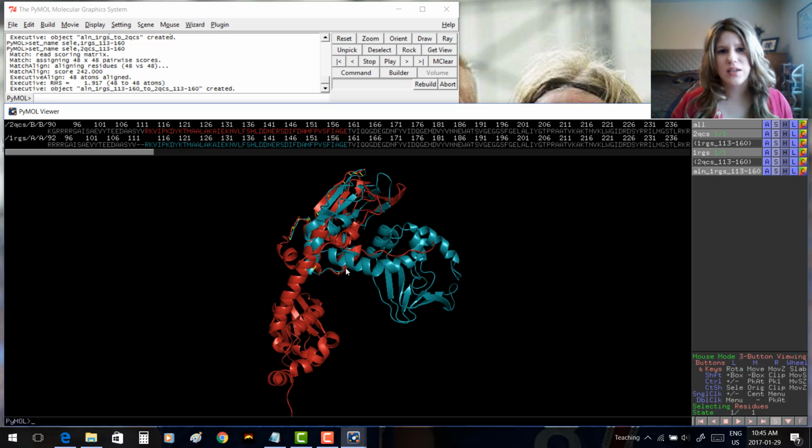So what's actually happening here is domain A matches very well, but this helix here has a large conformational change upon binding and bends around like this, and then the second domain is in a much different location than in this other protein. So there's a great article if you're interested in what's happening here by the lab of Susan Taylor. It was in Cell 2007 called PKA1 holoenzyme structure reveals a mechanism for cyclic AMP dependent activation. So this is a great paper that explains what's going on here, and they show these same types of diagrams to explain what they're doing.